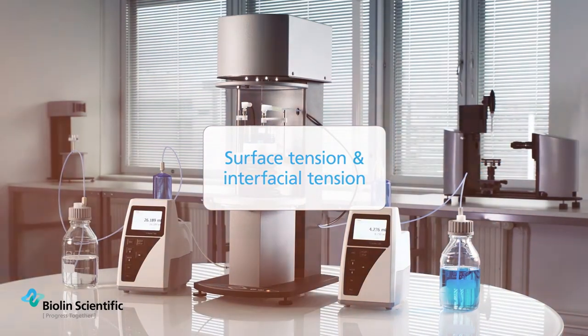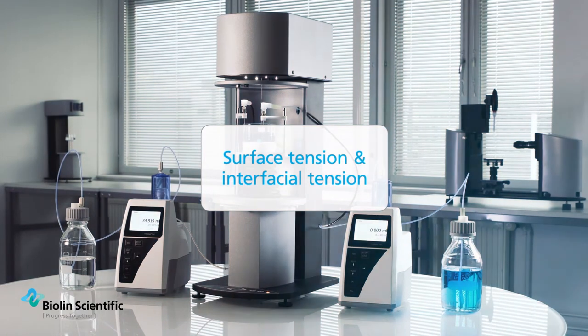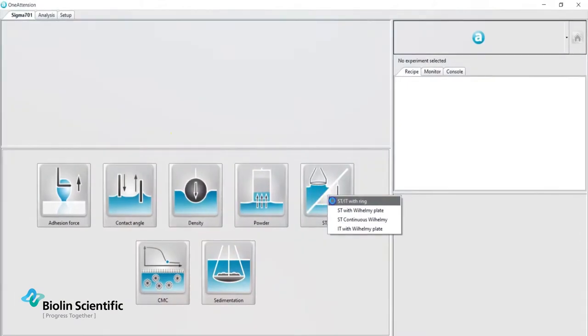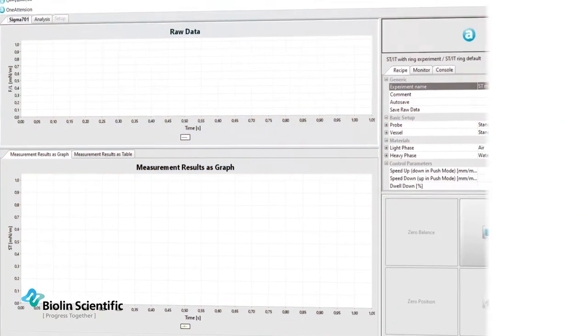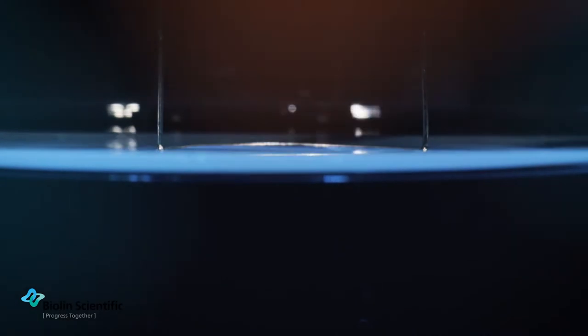The properties of liquids can be tailored with surface active molecules to enhance the wetting, for example in detergent industry. The tensiometers Sigma 700 and 701 measure the surface tension and the interfacial tension of a liquid by measuring the force the liquid places on a platinum probe.